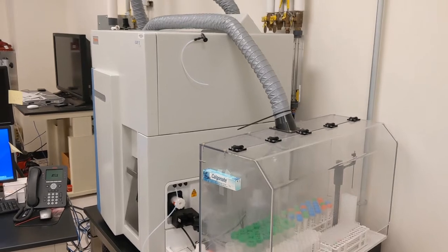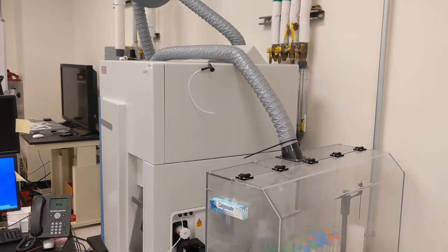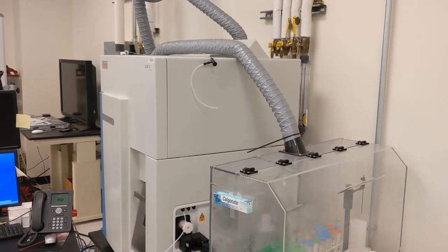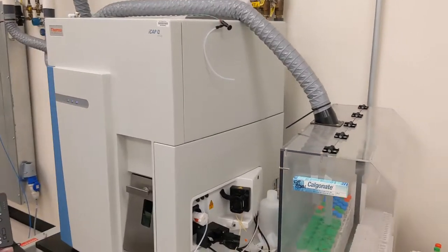If we're using laser ablation, we are also able to get a uranium, thorium, helium date, provided that we have already drilled a helium pit using the laser ablation setting on the Alphachron or the SFT.